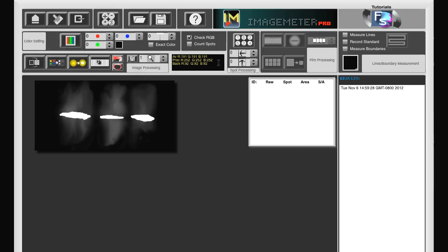The average value is 191, 191, 191. And the background value is 92, 92, 92. We could confirm the background once more, but that is not necessary in this case.